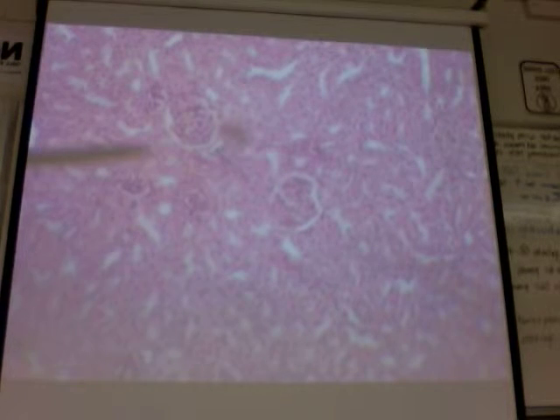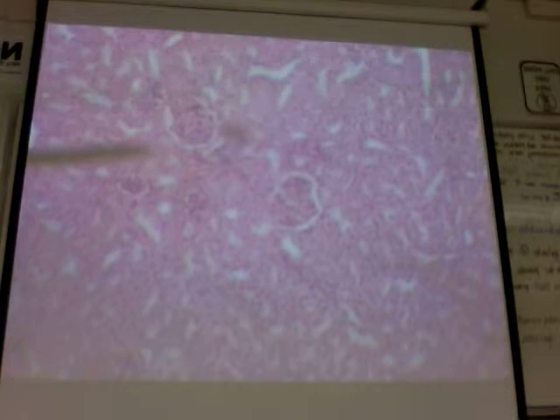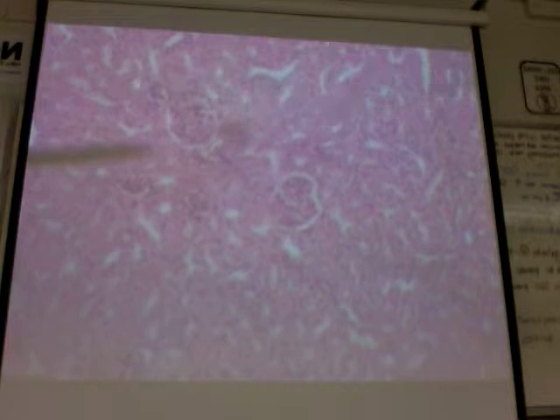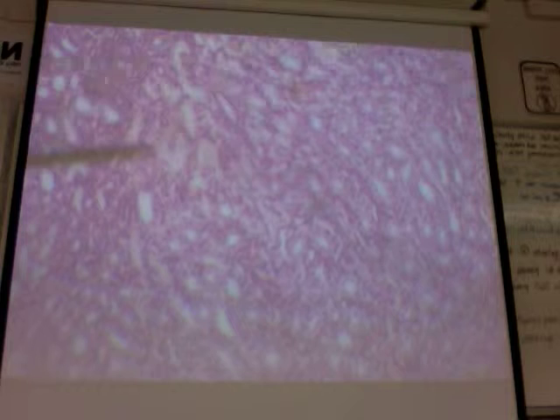And if you remember from last night, we were talking about where you find these structures. You only find, at least this visible part of the nephron. There are other parts that I don't ask you to find, at least on the slide. But if you recognize that for what it is, it's only found in one area of the kidney, and that's in the cortex of the kidney. If you move in a different direction, like say in here, where you're now in the medulla of the kidney, you'll see plenty of tubules and things like that. But you won't see any of those little individual structures called a renal corpuscle. They're only found in the cortex of the kidney.